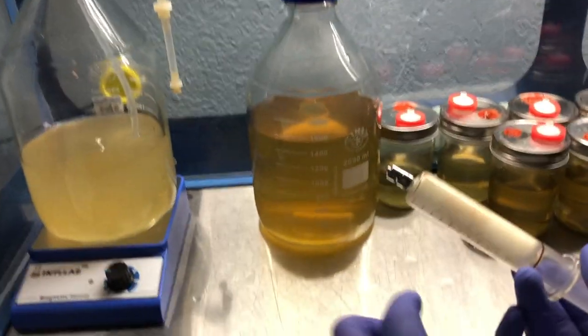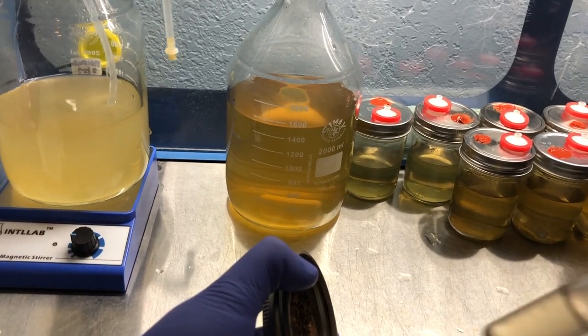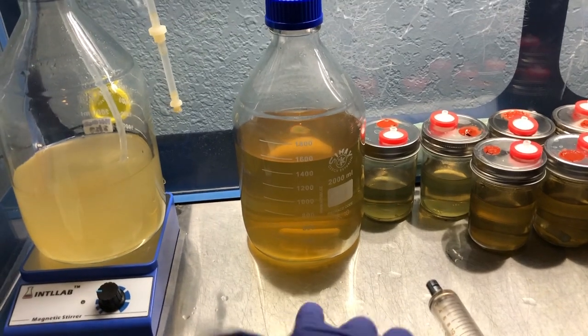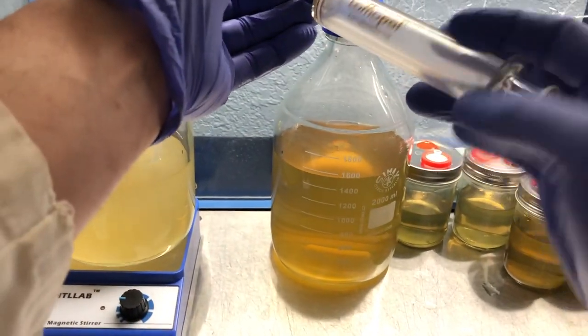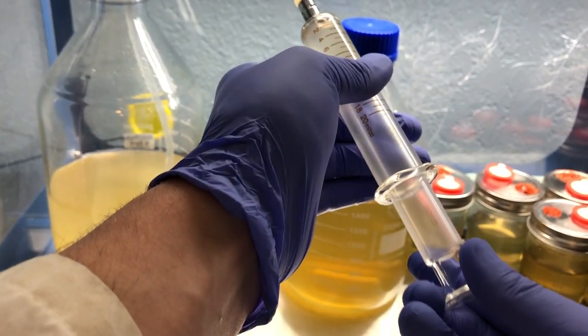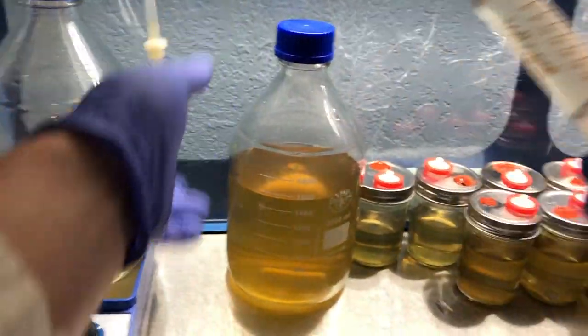So then I'm just going to go ahead and start inoculating these sawdust cultures. I did them on the drier side so I could inoculate quite a bit of mycelium. I'm going to try to do 20 mils.